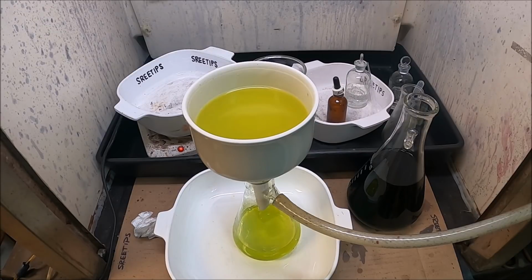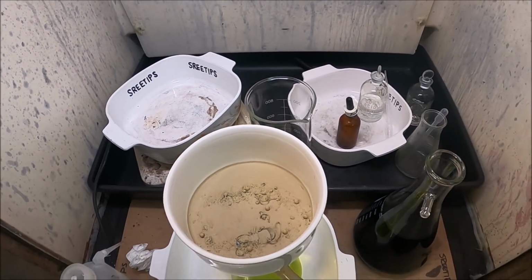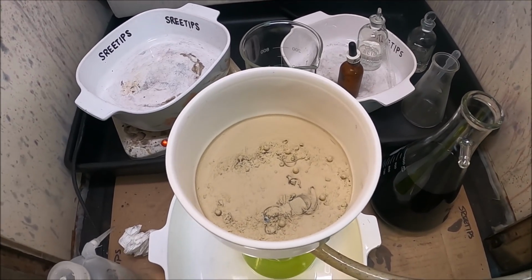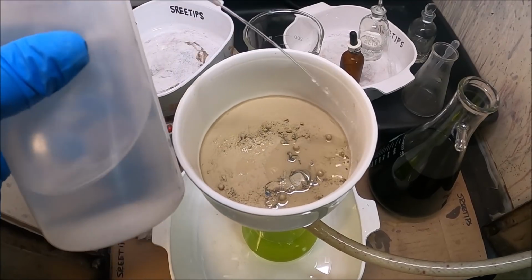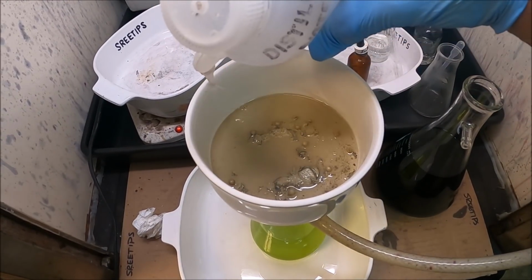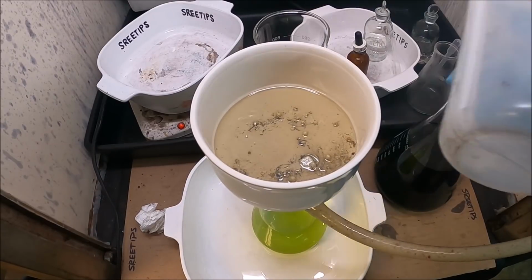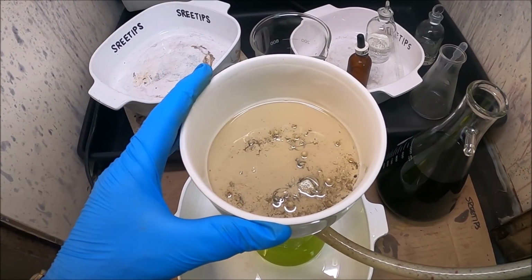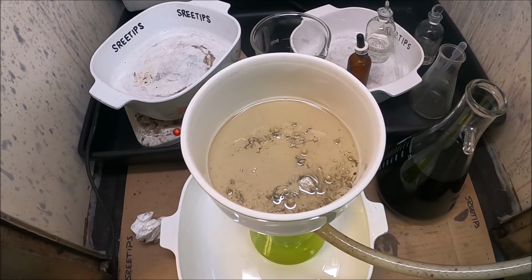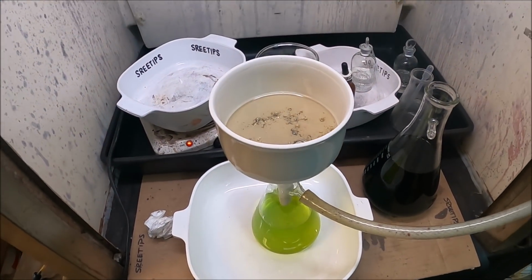This is about 2 hours of footage on time lapse and speeded up 8 times normal speed. All right, here's what's left in the filter. What we'll do is I'm going to rinse this now with a little bit of distilled water so we can get the rest of the gold solution that might be present pulled down into our solution in the flask. And then once I get all this liquid pulled through, we'll combine the two solutions, this one and this one, in a large beaker, and then we'll go for precipitation.